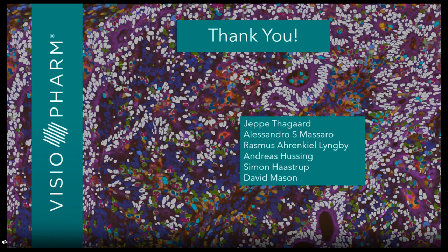Yes, I can just echo that. One of the things that one of my former bosses at AstraZeneca, Carl Barrett, was always saying: first think about your hypothesis before you put the panels together. And I think this is a very wise one. First we need to all think about what is the mechanism of action or the proof of mechanism that you would like to see, because most of the phenotypes that you are hunting are already known.